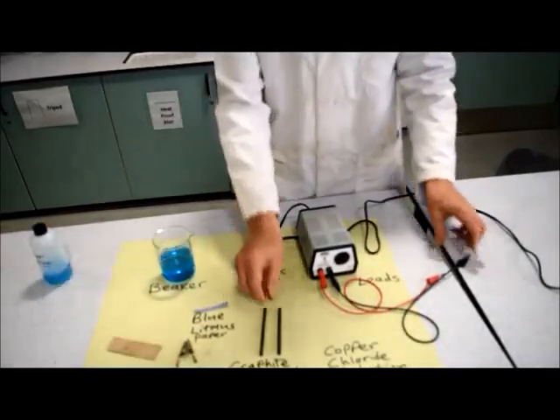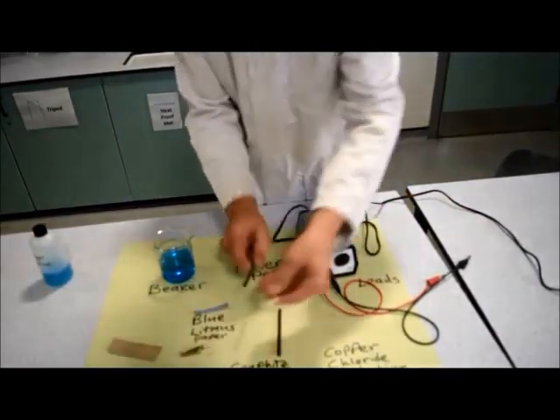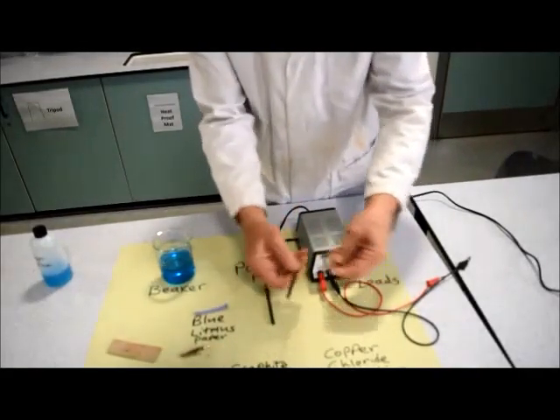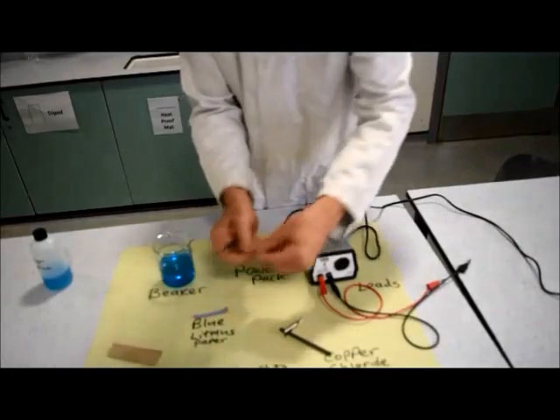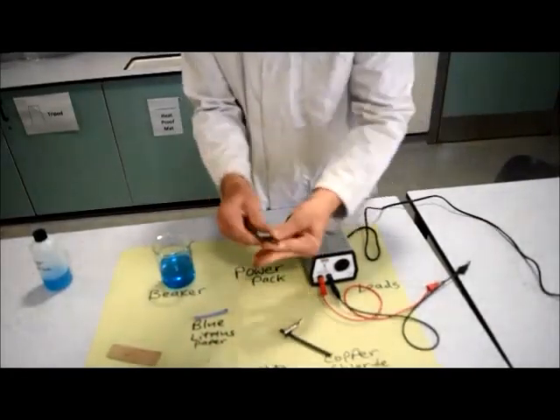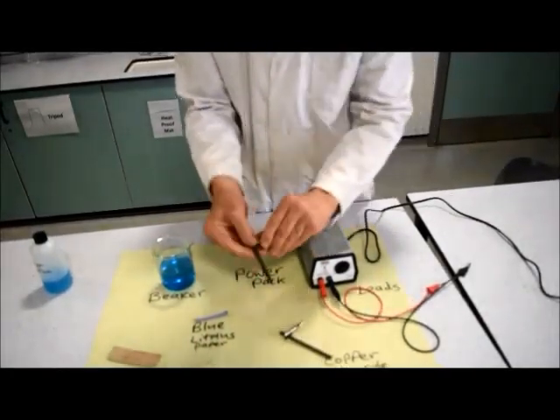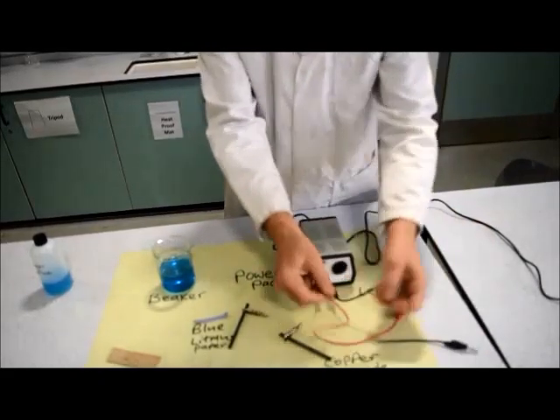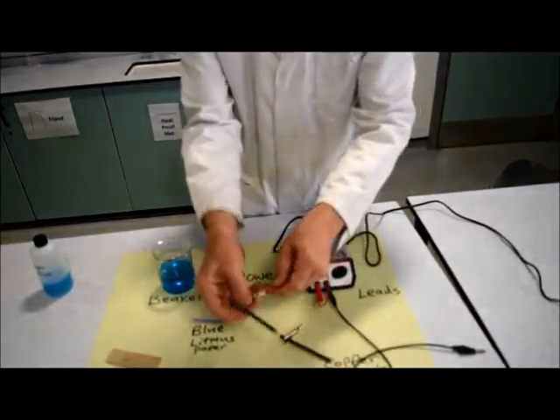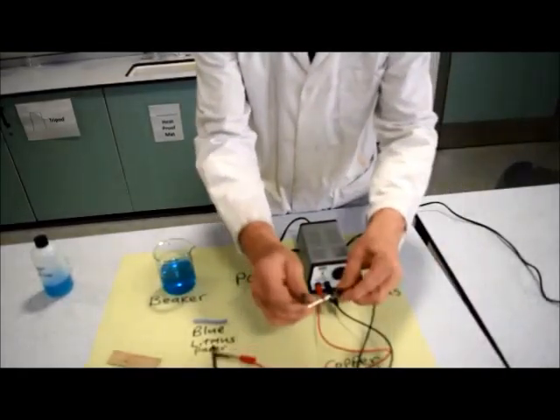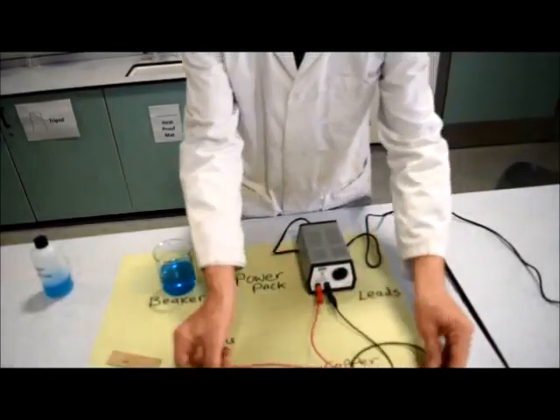Then we connect the electrodes to the crocodile clips like this—one clip there and one clip here—and then these go to the leads like so. There's a black lead and a red lead.